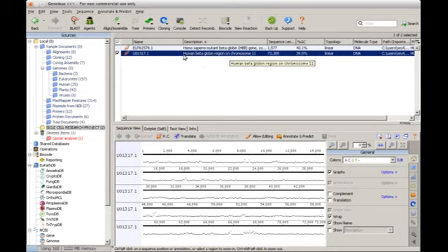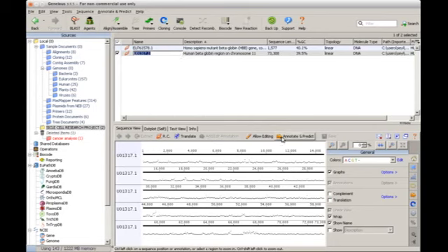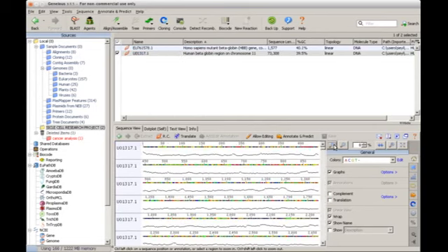So immediately click it to give you here. It's starting from number 1 to 73,308. So this is the last part of the nucleotide bases in this sequence. The next thing you do is you zoom, keep zooming.